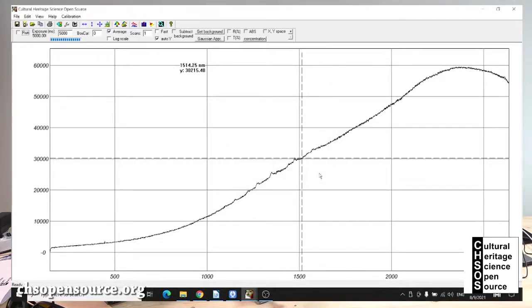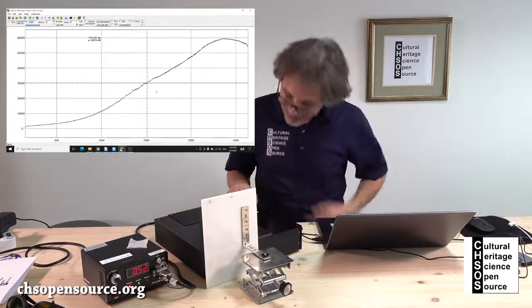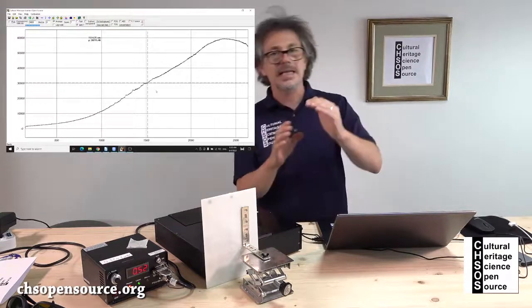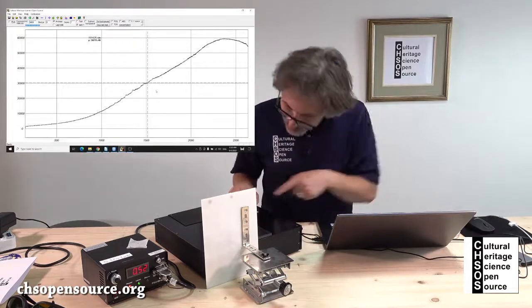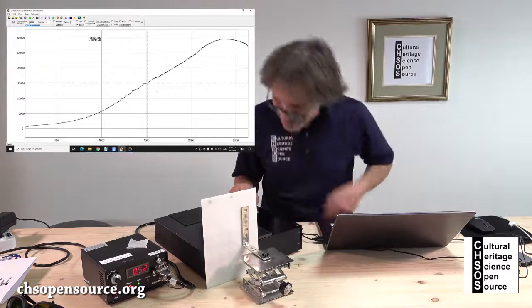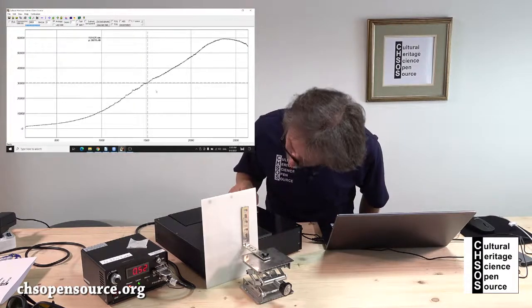And this 5,000 acquisition time, you see, is basically the maximum we can do, because otherwise the spectrum starts to be saturated. Remember, the maximum you can collect is 60,000 counts on the y-axis. Okay, so that's much better. Let's see what happens if we use like 2x the value here on the knob, which is a little bit more open. So this is basically the value that will ship with your instrument. So it's written over here, 2x. So I'm opening a little bit.